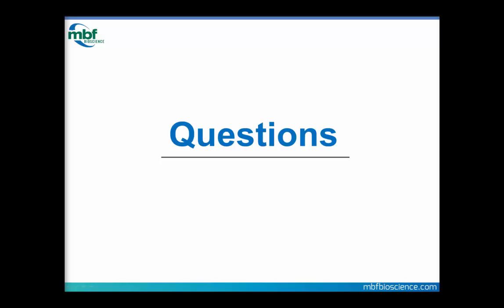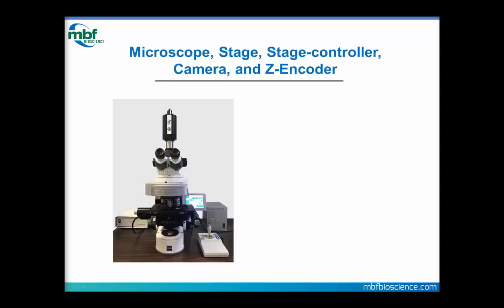And now hopefully the parts that I just went over about theory will help us understand this practical demonstration I'm about to do. I did this on the system shown here. It's a Zeiss Axio Imager Z1 microscope. It has a lot of electronic components. For instance, the shutter that allows the bright field light to come through is electronic. Our software talks to all of those electronic components and controls them. I'm using a QImaging Retiga color camera. This is a bright field system.